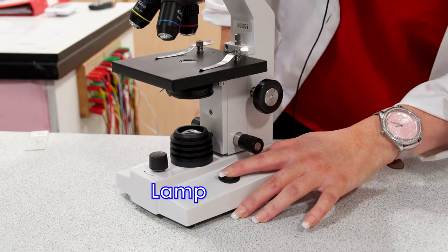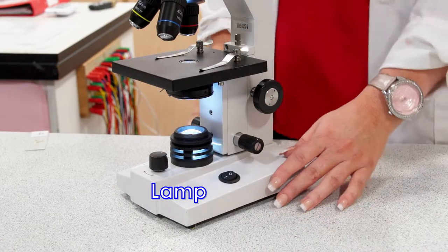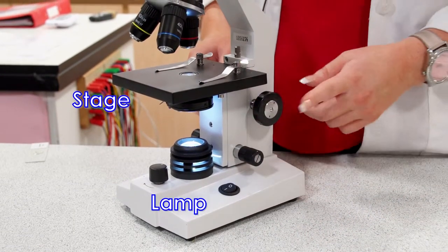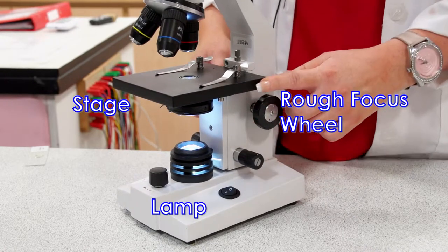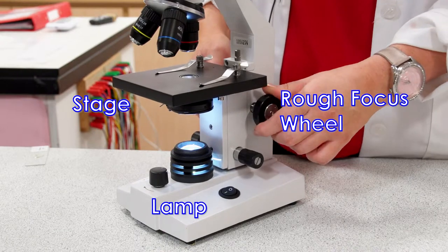You have a lamp down here which you can turn on using this switch. This dark piece of metal is called the stage, and you can use the rough focus wheel to make sure that your stage is at the lowest point before viewing. You can use the rough focus wheel to move the stage up and down.